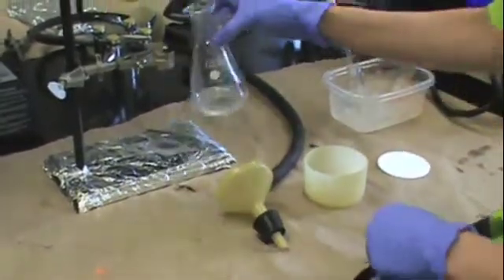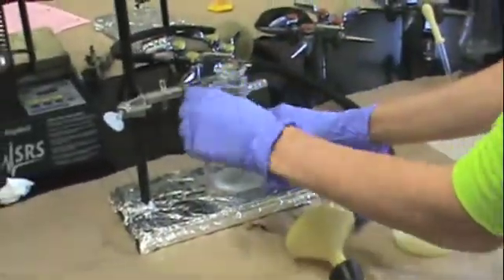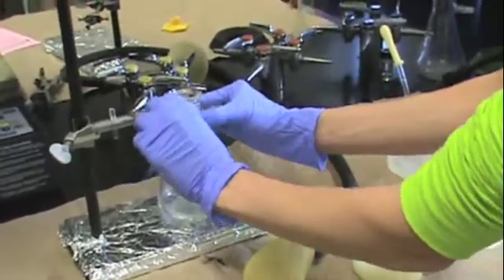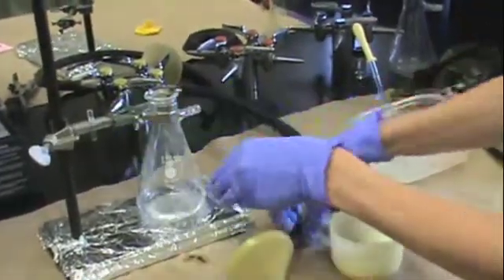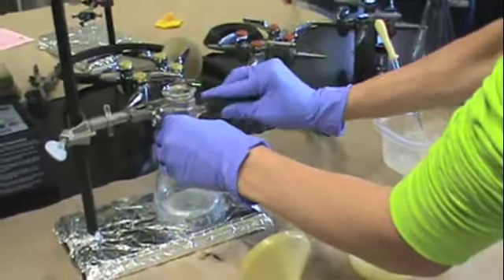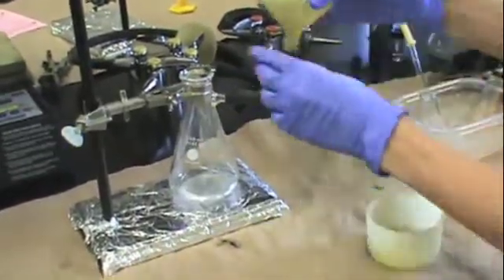Attach the sidearm flask to a clamp that you have prepared on your ring stand. Make sure to clamp it tightly. Then attach the hose connected to the vacuum line.